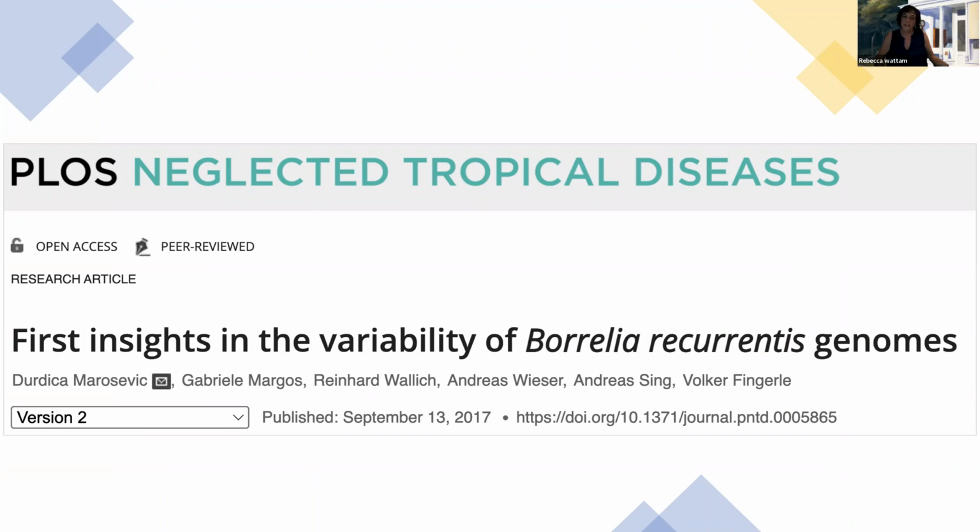If you've watched any of my webinars in this series, you know that I take a paper and then we walk through the analysis of it, and then I say, what can we do? Could we do the same thing in BV-BRC? So this is today's example, and for those of you who are tick researchers, you're probably looking at this and saying, Borrelia recurrentis? Borrelia burgdorferi is transmitted by ticks, but recurrentis, I'm not so sure.